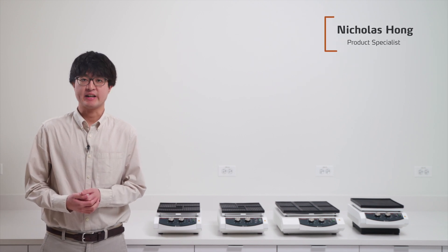Hello everybody, I'm Nicholas Hong, Product Specialist for Life Science Solutions at Heidolph America.